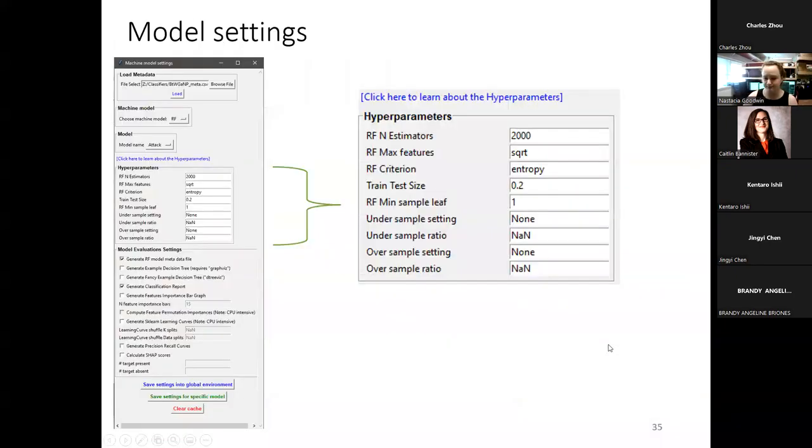So, okay, that's how you go through and make a good training set and annotate all of your behavior. And then I just wanted to include some information on model settings. When you go to train your models, we have this metadata file with this acronym that stands for behavior that will get you a Nature paper. You just open that CSV and load it, and you have all of our defaults loaded in here for how to work with the random forest.